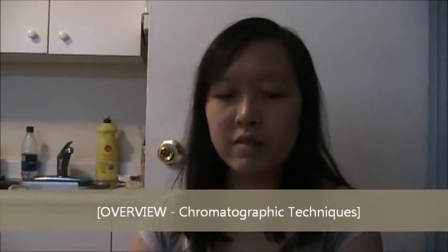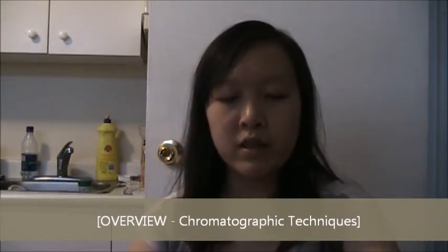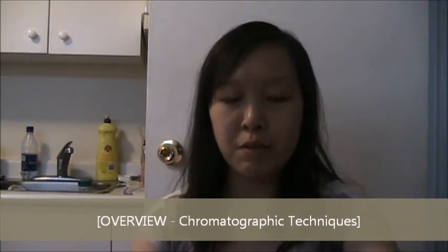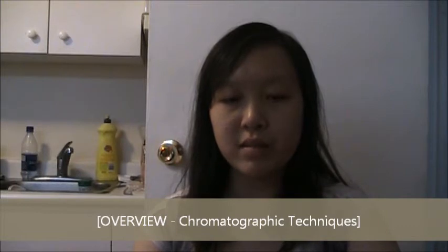I'll also be covering 2 chromatographic techniques in this video. The first one is gas chromatography, mass spectrometry, and I'll also be covering high-performance liquid chromatography. All forms of chromatography rely on a mobile and stationary phase to separate compounds.